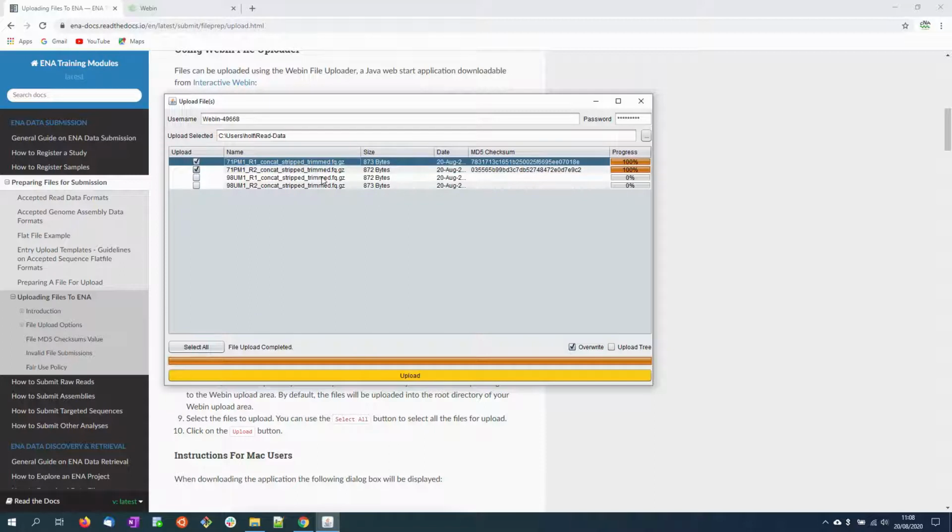The way the internet is, occasionally when you upload a file, there'll be some interruption to the process, or it may become corrupted in some way. And this corruption changes the MD5 value. So we collect the MD5 value from you at submission, and then we check the MD5 of the file that exists in your upload directory. And if they match, then we know that the file has come through in its entirety, whereas if they don't, then we know to inform you that the file may not have been uploaded correctly and that it needs to be redone.